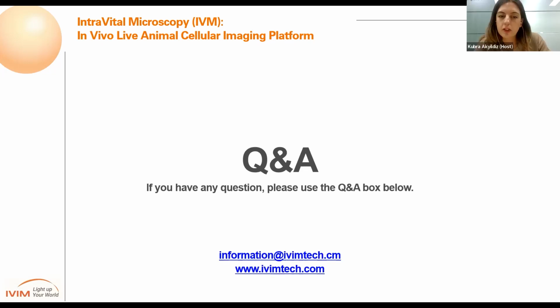Thank you for the answer. And there was another question previously asked before the webinar. How deep can we image in vivo inside the brain? Actually, it depends on the imaging target organ with different light scattering properties, such as fat, lipid, and membrane, etc. And it also varies upon the microscopy system itself.